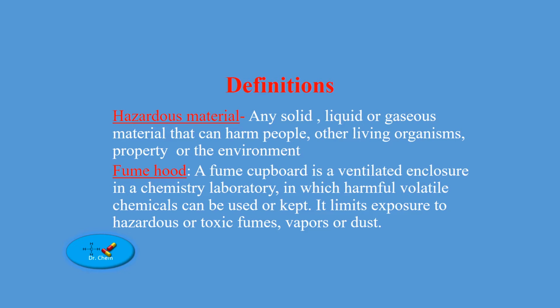So what is a fume hood? This is a ventilated enclosure in a chemistry laboratory in which harmful volatile chemicals can be used or kept. It limits exposure to hazardous or toxic fumes, vapor or dust.